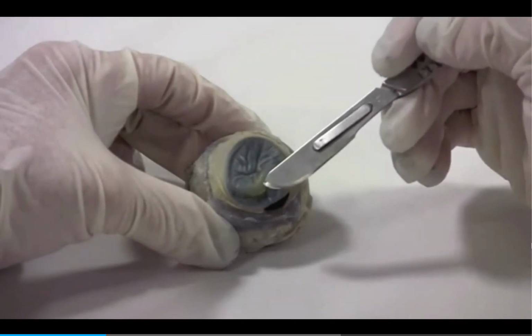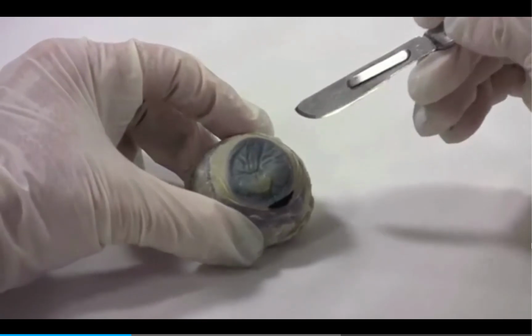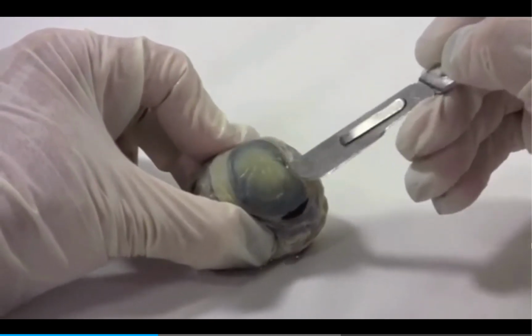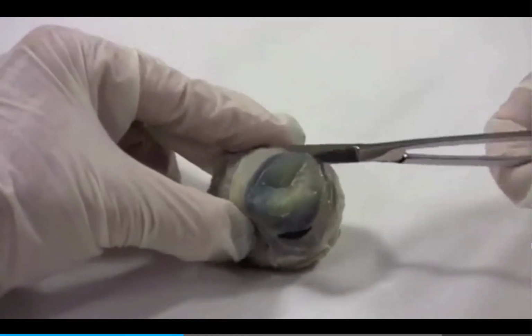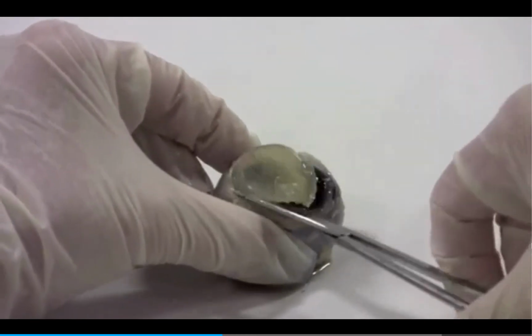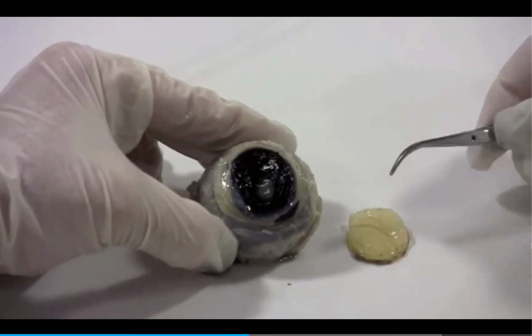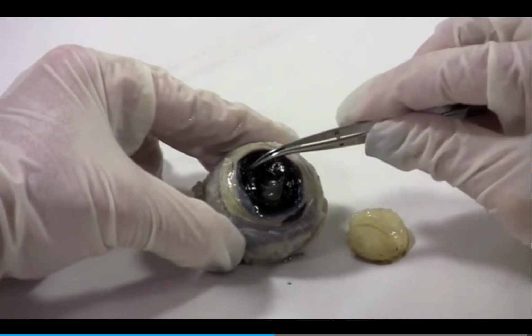Let's remove the cornea of the eye and look behind the cornea into the anterior chamber. You'll notice a clear watery fluid leaking out of the incision. This fluid is the aqueous humor, which fills the anterior segment. The anterior chamber is the space between the cornea and the iris.